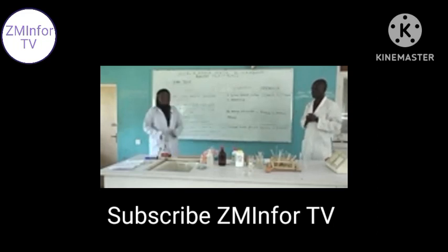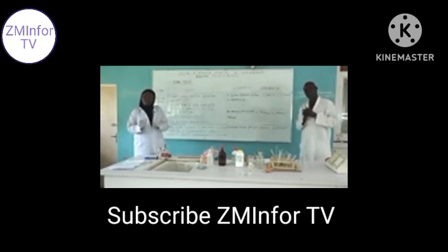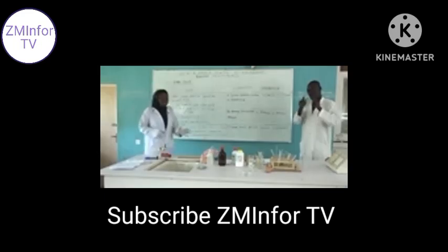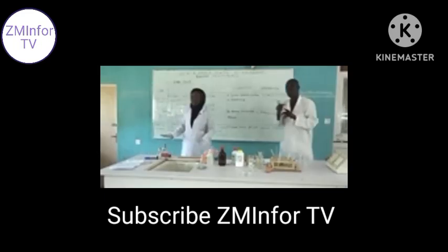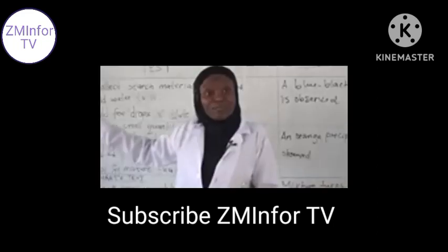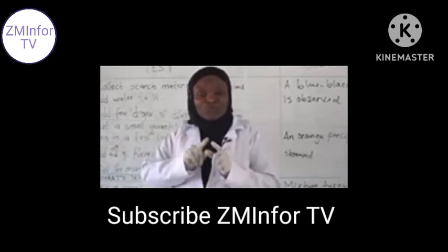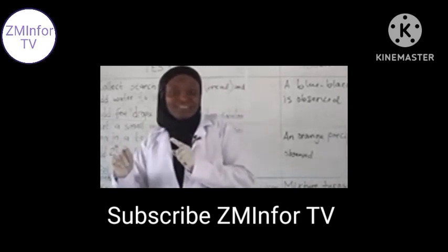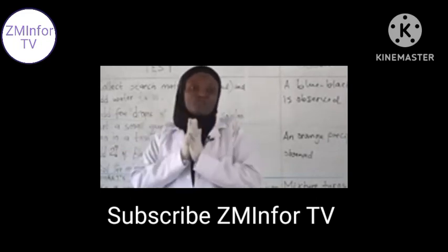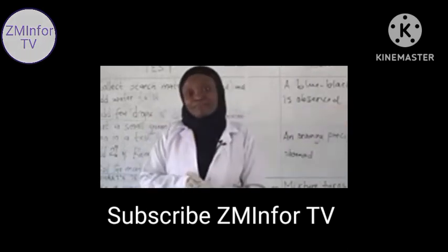So it is very important that we know these things, we carry them out carefully and gradually, and we have our best result if we keep to the instructions given. The examiner will definitely give you the table. Test for a particular thing gives you the procedure, and it is left for you to follow the procedure strictly and then observe what will come out of it. Your observation gives you your inference.